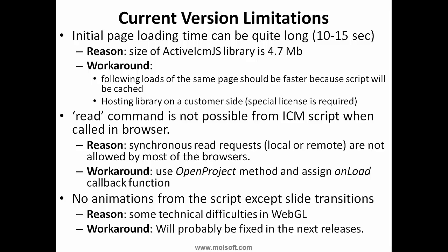And some other stuff: animations are currently only supported in slide transition. So if you have some script which produces some animation, that will not work in ActiveIcmJS mode, but I can probably fix that in the next releases. It should be possible technically.